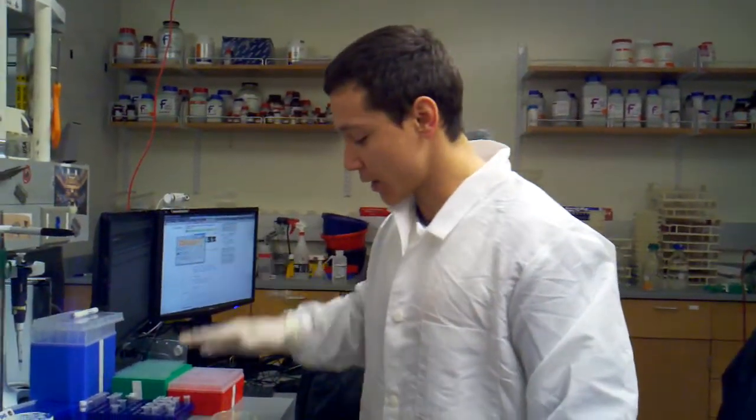Hey guys, we're going to finish up our chemical competent transformation. We put some plasmid DNA into some competent cells out of the negative 80. We heat shocked them. We then recovered them at 37 degrees in the shaker down in the corner. And now we're going to plate them.